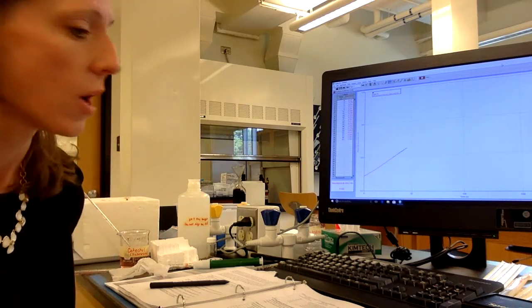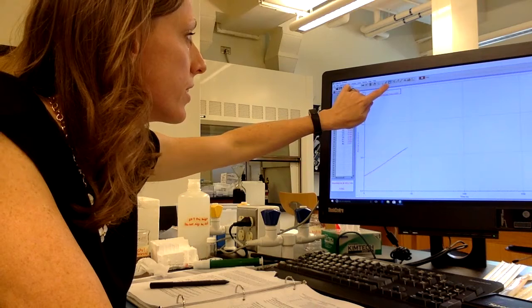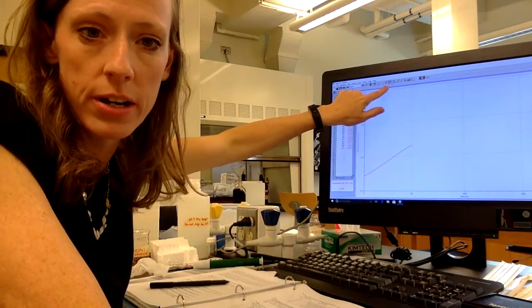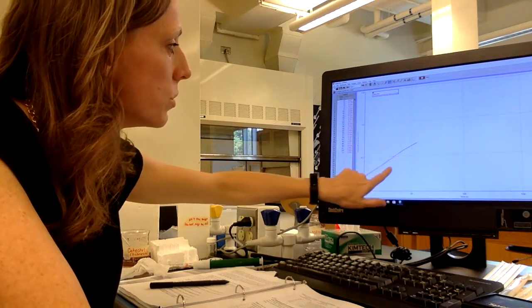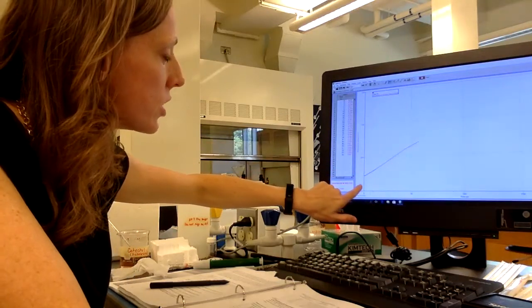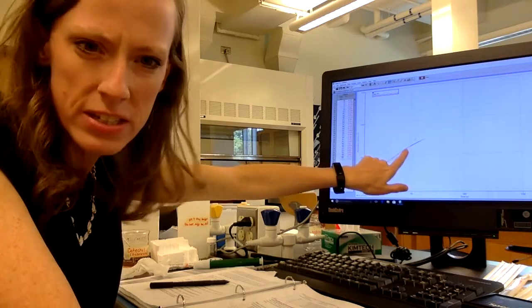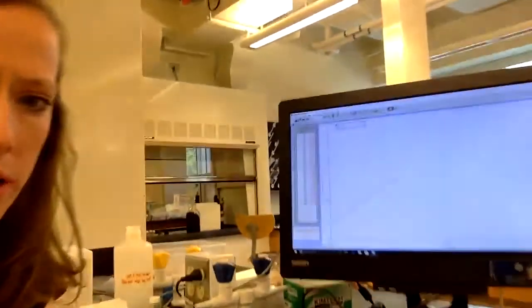And in the meantime, I'll point out that I have this tangent button already clicked here. I can click it off, but this is the tangent button, which will allow me, when I click it, to get a number for the slope here. So if I bring my tangent line, I don't know if you can see it moving along the curve there. Bring it a little closer.